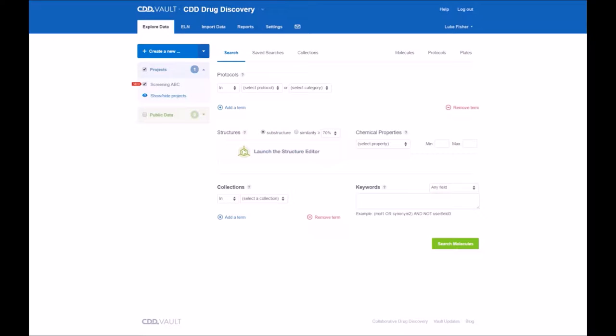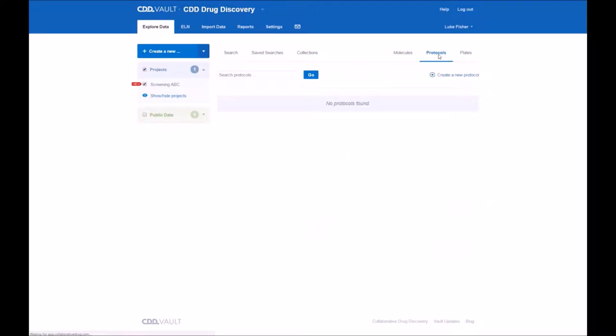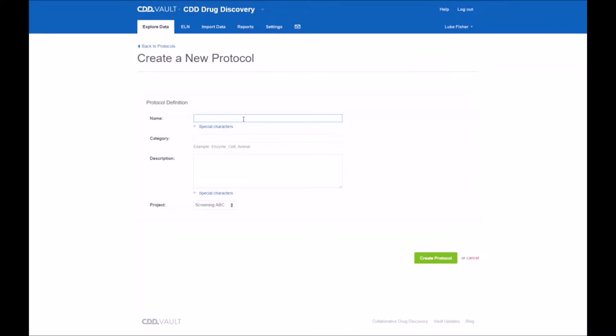To begin, you can create a protocol in a couple of different fashions in CDD Vault. First, under the pull-down menu is one choice, but over here as well, you can use the Create New Protocol button.